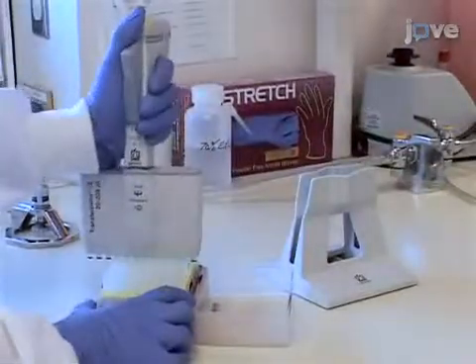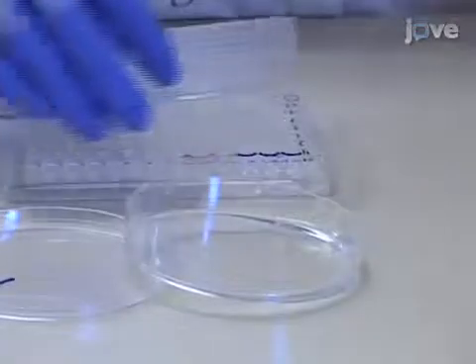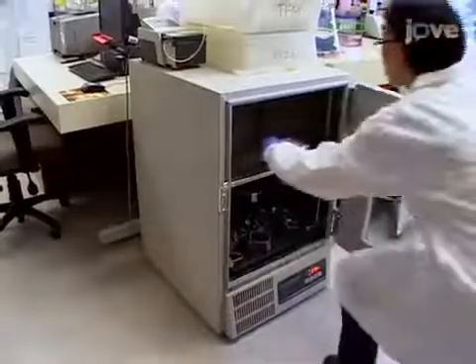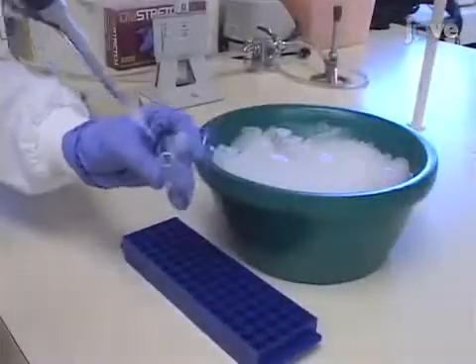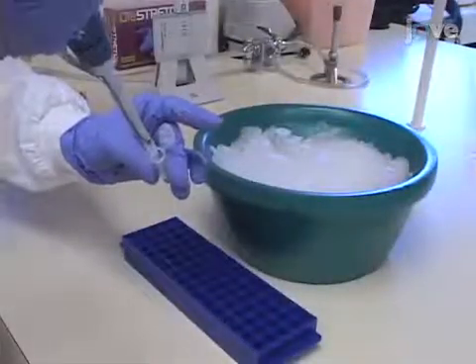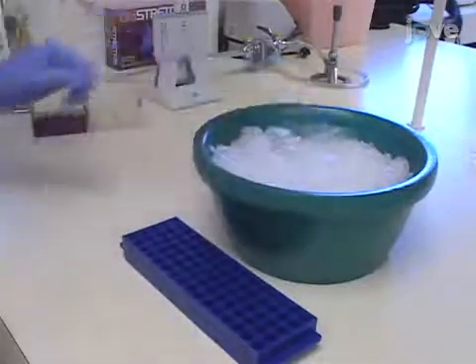Then aliquot 100 microliters per well, allotting 24 wells for each strain. Incubate for 24 hours at 37 degrees Celsius. Next, prepare 10X stock solutions of a dilution series of antibiotic for seven wells and store on ice.